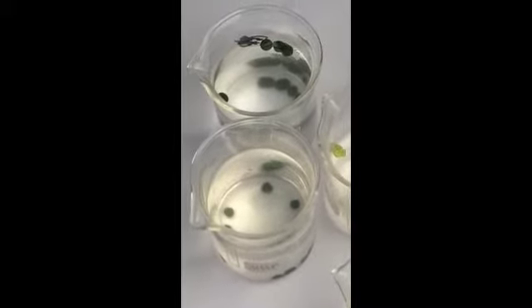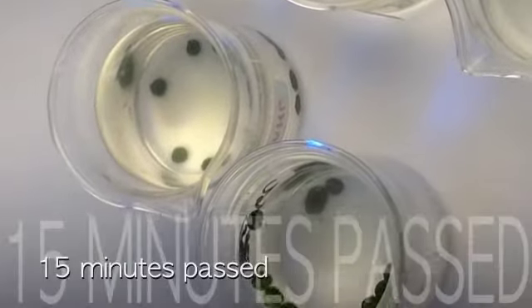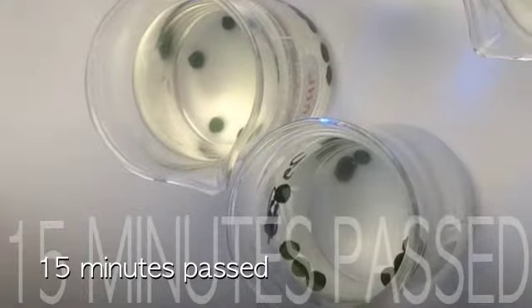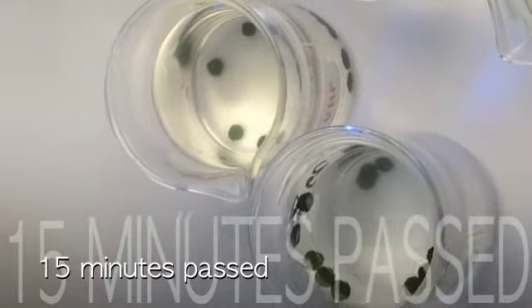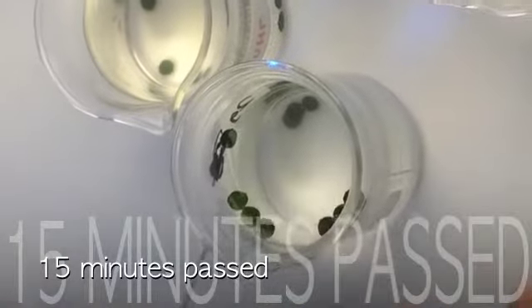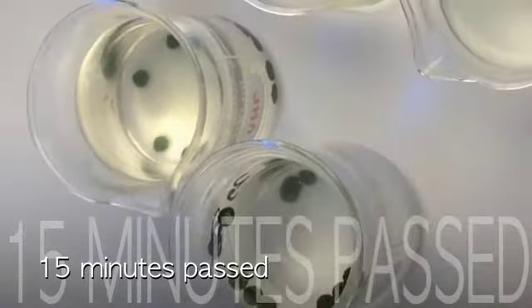As you can see, all the room temperature leaves are floating. We're 15 minutes into our observation, and it seems like the hot water has denatured the plants, but the room temperature water didn't. So that's why it's floating.